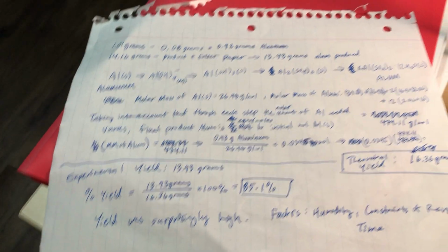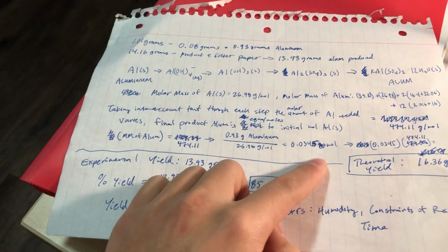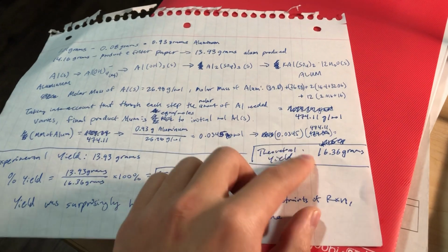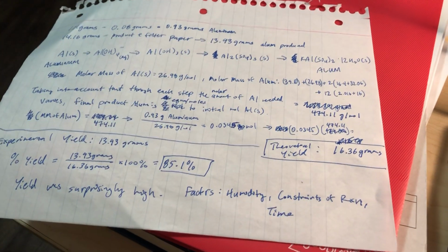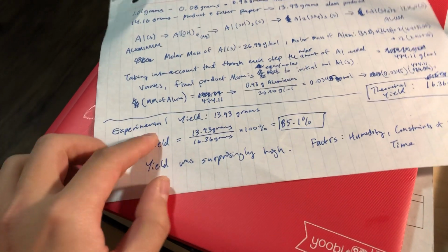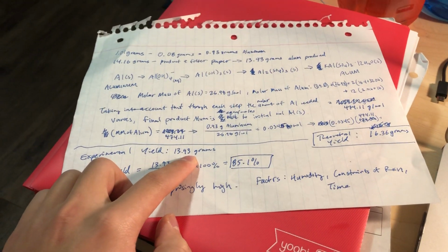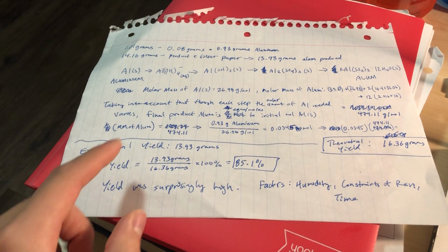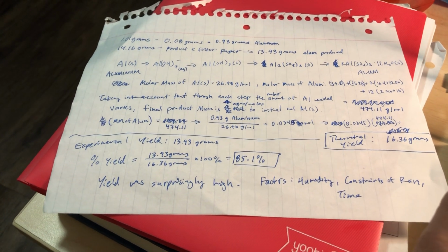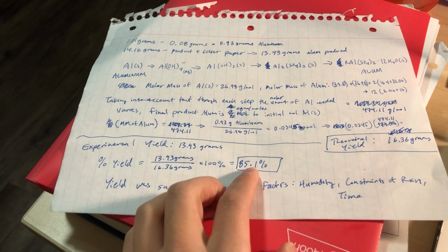And then we know it's a 1-to-1 ratio. If we put in 1 mole of this, we get 1 mole out. So that's why we take the number of moles of aluminum, multiply it by the molar mass of alum, and we get a theoretical yield. So what we should get if everything goes to plan is 16.36 grams of alum. And our experimental yield, which is how much we actually measured up here, is 13.93 grams. To calculate percent yield, we take the 13.93 grams divided by the 16.36 theoretical, so experimental over theoretical, and then we multiply by 100%, and that gives us 85.1% yield, which is pretty good.